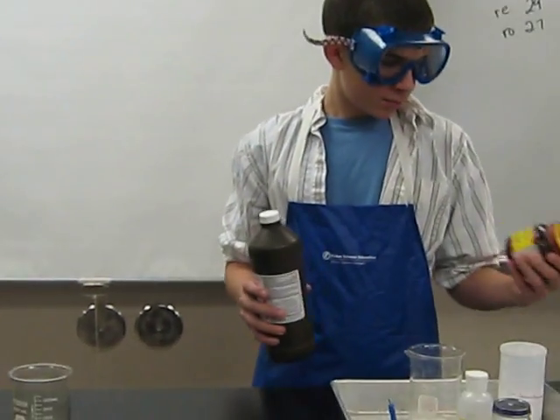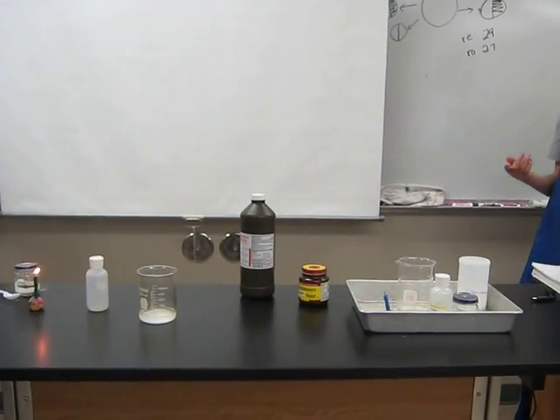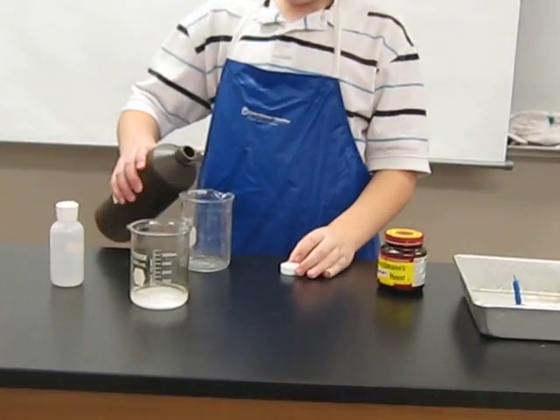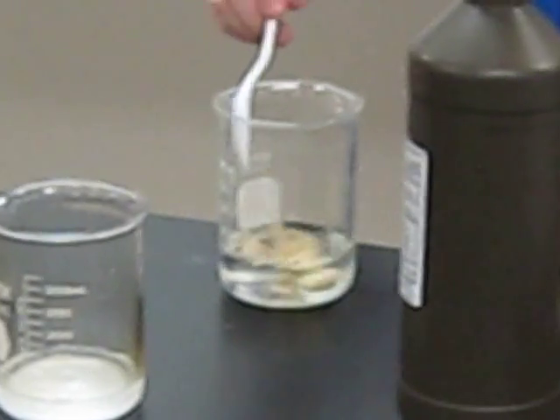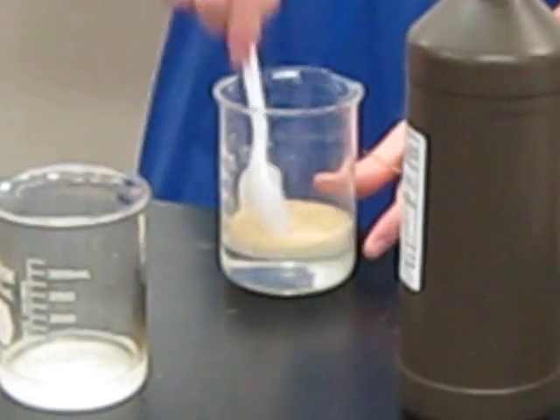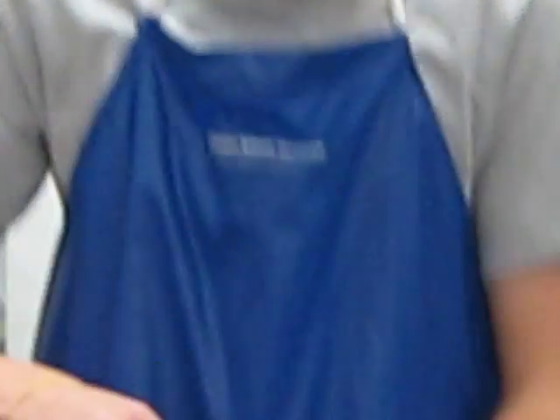Next, we are going to mix brewer's yeast and hydrogen peroxide, and then stick an extinguished splint over the gases. I will now pour the hydrogen peroxide in the beaker. I'm going to stir it for a little bit, then get the splint on fire, blow it out, and see what it does.